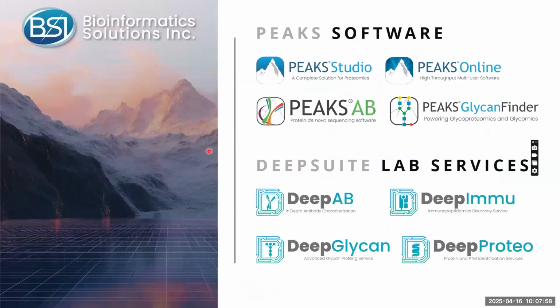Now for BSI, we have two parts of our service. The first part is our Peaks software. Maybe you are already familiar with our product. We have Peaks Studio, a standalone product for bottom-up proteomics. And we have Peaks Online, designed for very large cohort studies. For example, a customer can run 1,000 DIA samples in Peaks Online. We have Peaks AB designed for antibody sequencing, and Peaks GlycanFinder, which is more specific to glycoproteomics and glycans.